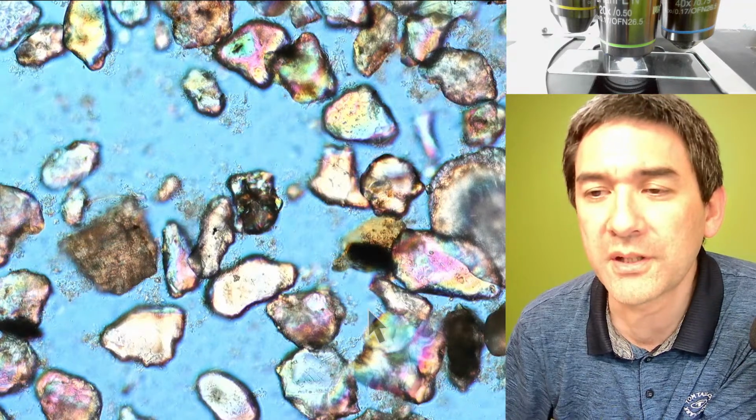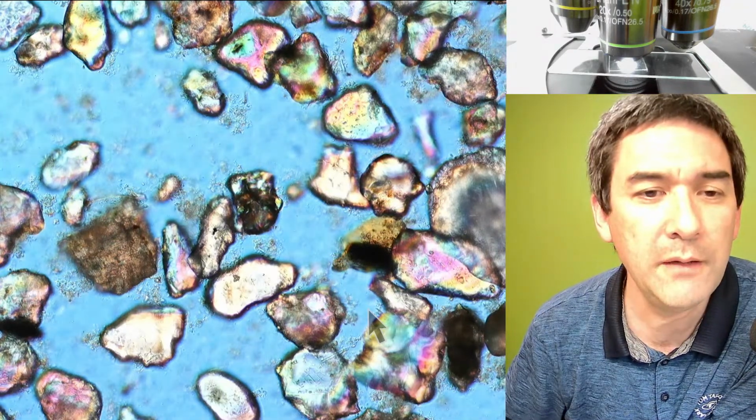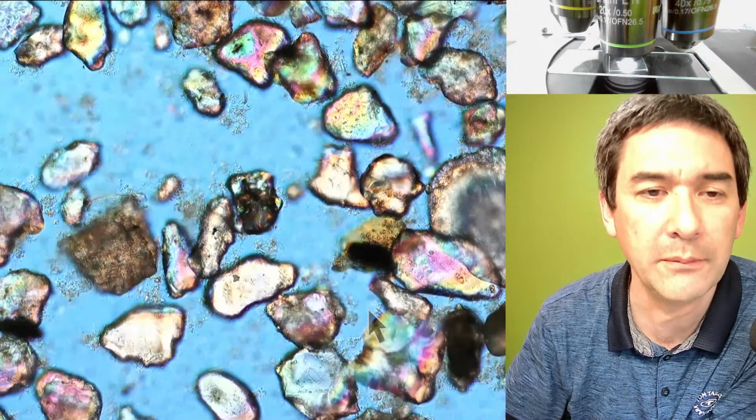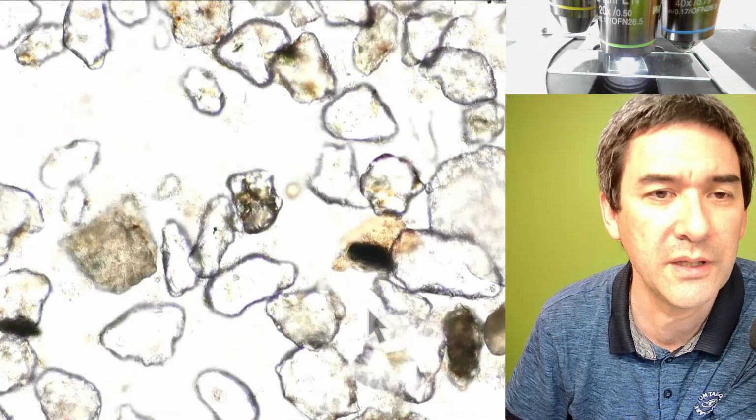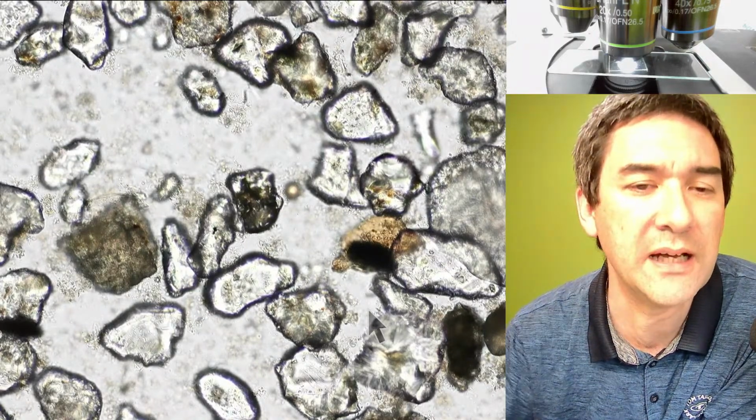Because somebody's asking, I'm using a polarization setup, it's called DIC. If you want to watch the whole thing in bright field, because most of you have bright field, then it would look like this. This one now also uses the natural colors.